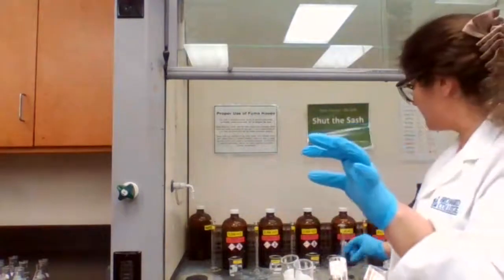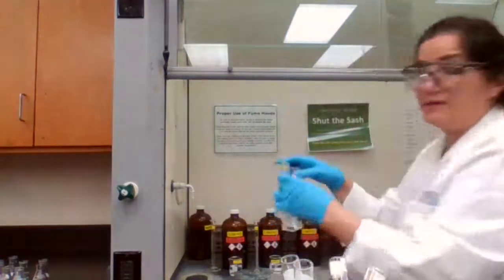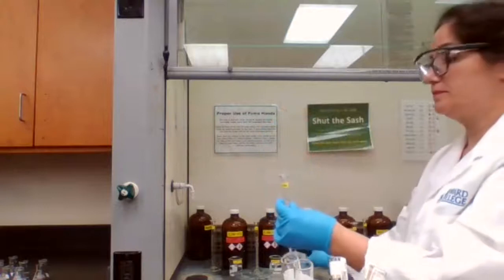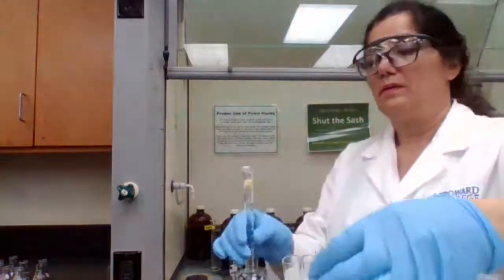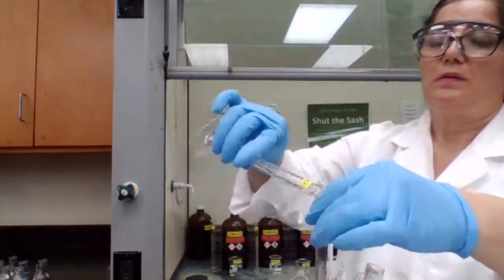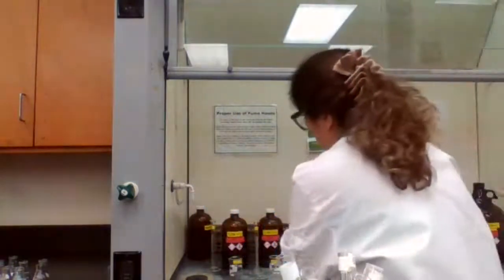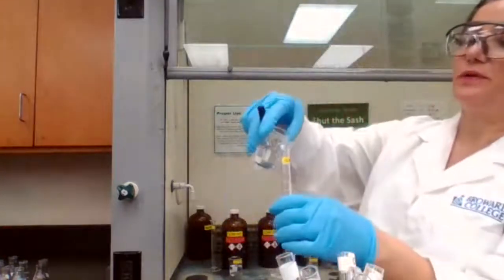To test tube 3, adding 10 milliliters of 0.6 molar. Test tube 4, adding 10 milliliters of 0.4.